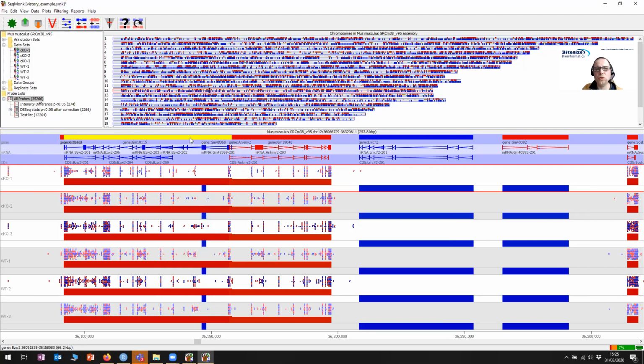So here I might want to label this gene, but I can't actually see it because this gene got labeled first and it won't draw the labels over the top. So it does show me a lot of stuff, but often it doesn't show exactly what it is that you would want to see. So if I turn those off, and I wanted to be more specific and say, well, look, this is the gene I was particularly interested in, so this is the one I want to show, I can make it highlight by just putting my mouse over it.